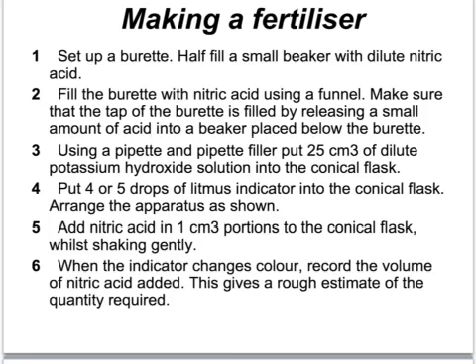The indicator gives just two colours. Once litmus is added to the conical flask with the potassium hydroxide, it turns blue, showing it's an alkali. We then add the nitric acid in small portions while shaking gently, watching for a colour change. When the indicator just changes to red, we stop adding acid from the burette and record the volume added as accurately as possible.